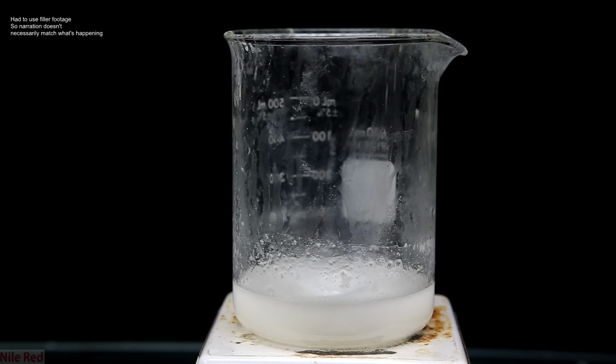Before proceeding on, I highly recommend you let it cool down all the way to room temperature. The next step is to add hydrochloric acid, and the reaction can be pretty exothermic. You can see here I didn't let it cool enough, and when I pour some acid in, a lot of splashing occurs. That little experience taught me a lesson, and I decided to let it cool down all the way to room temperature before adding more.